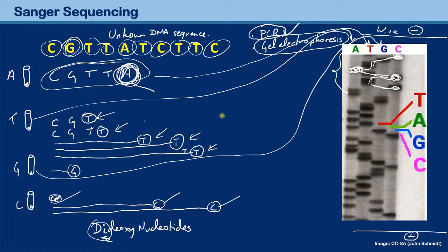And that is the reason why back in 1980, Frederick Sanger got the Nobel Prize for determining this. And this system is still used, of course, nowadays. You have a machine that does that. You don't have to read it off yourself by hand anymore; you drop the original DNA into the machine, and out comes the DNA sequence on the computer monitor, right? So this is really a very standard and very automated procedure nowadays to determine base sequences.